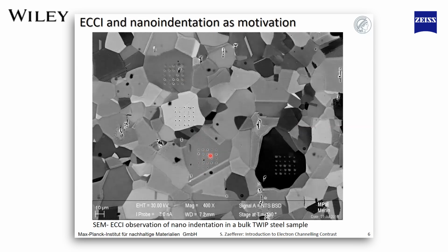Now, we have done that, and we obtained dislocation information from many different orientations, and then we went still one step further. We polished these indents away, which is just half a micrometer of polishing. The grain structure stays the same because it is quite big grains. Then we charged that sample with hydrogen, and we indented exactly the same grains again. And then we can compare how dislocations behave with and without hydrogen stored in the material. And that's what I would like to show you right now.